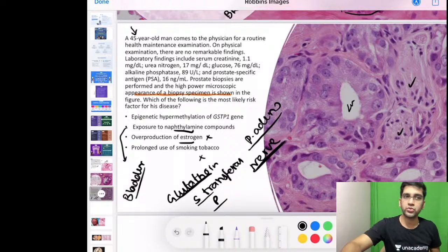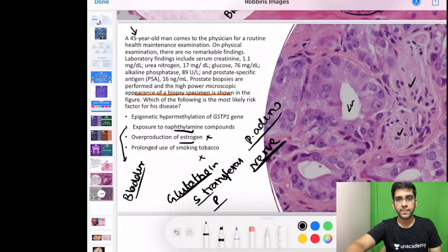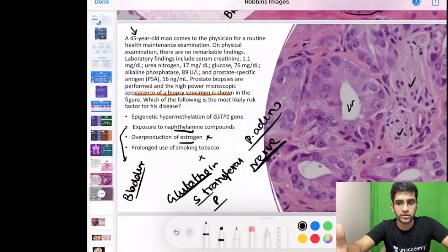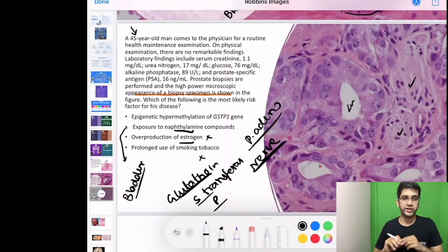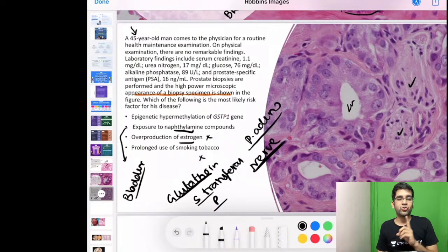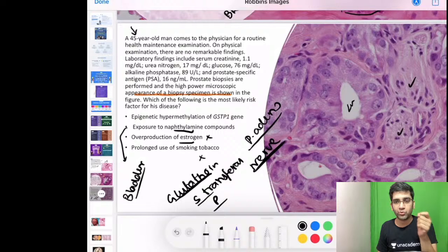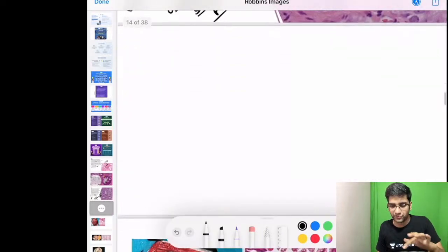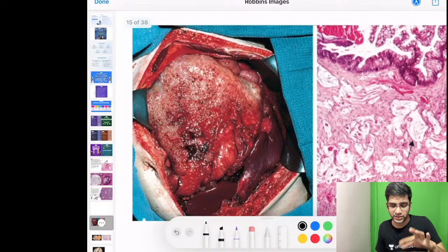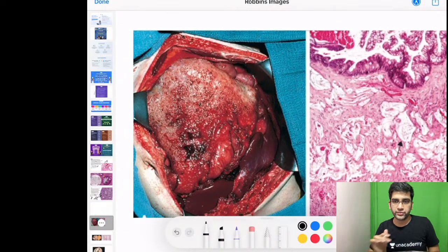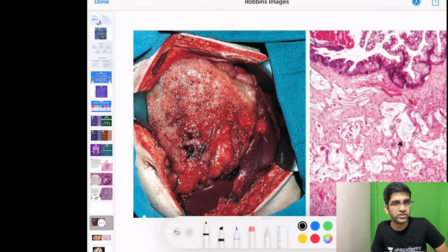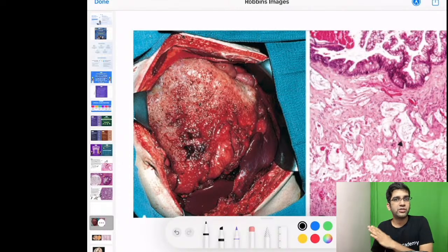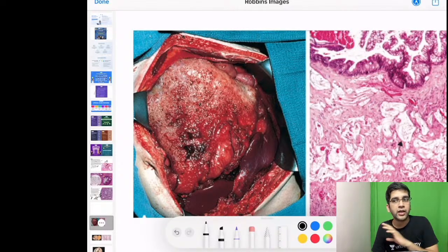Those are the three MCQs. Now we'll go to the Robbins images — ovarian tumours through to breast parenchyma, as far as time permits. I want the same level of engagement as on the app. Let's see if you can relate to this first image.